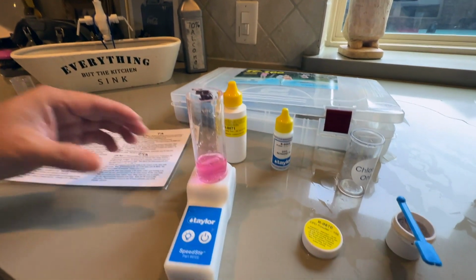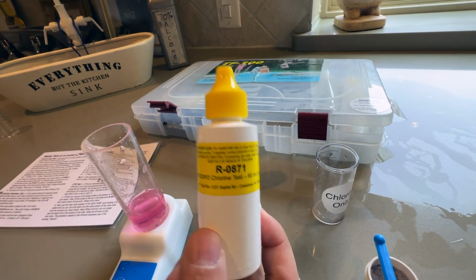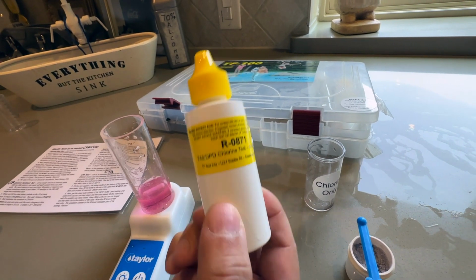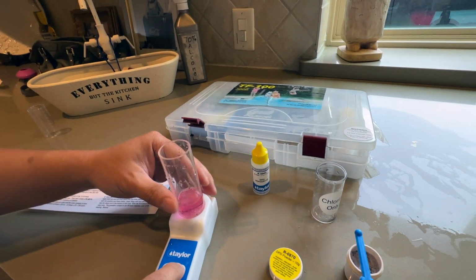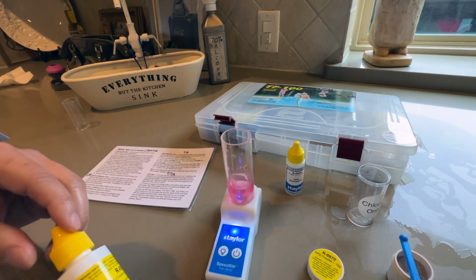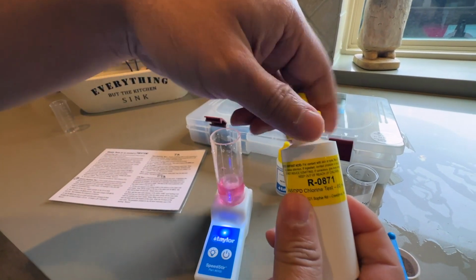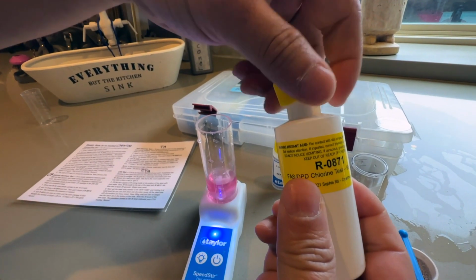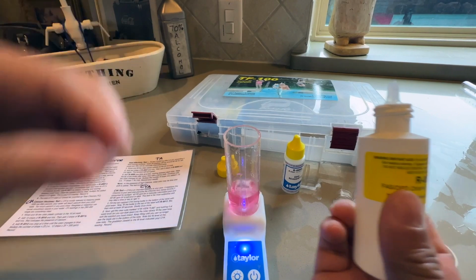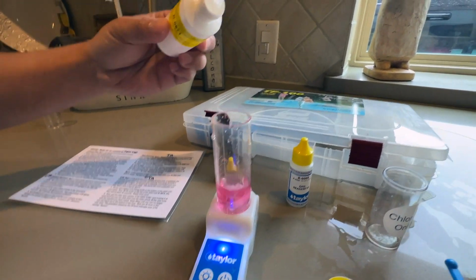Now we're going to go to the next step, which is counting how many drops of this. I'm going to start dropping this. Turn this on so that it starts stirring. And I'm going to open this one and shake it first. This is the R0871. The number of drops is really important here because we're going to divide that by 2, and that's going to be the level that you will have.